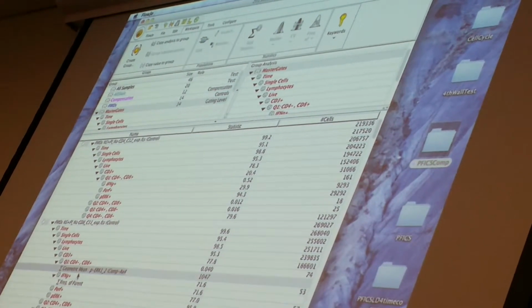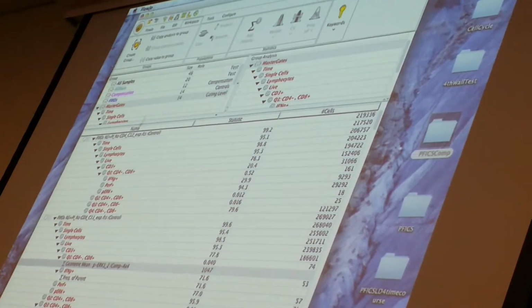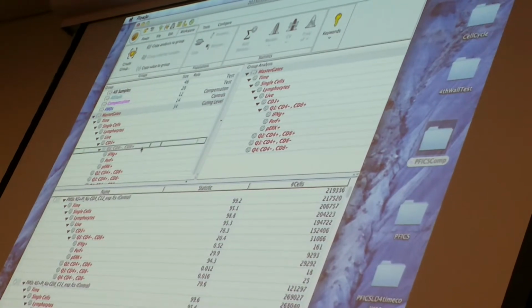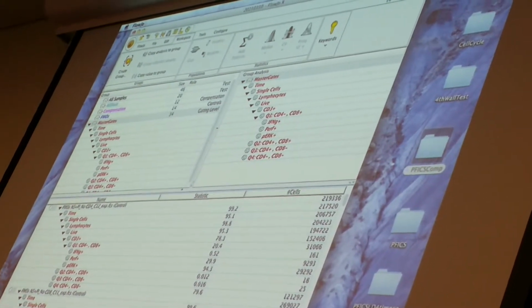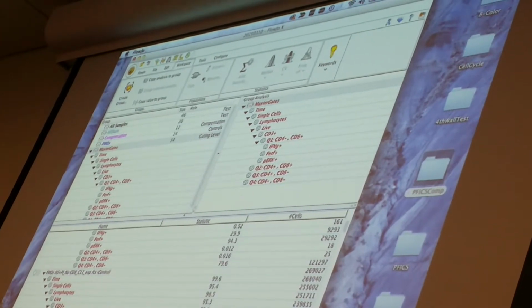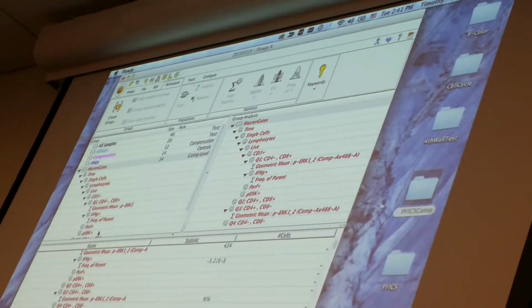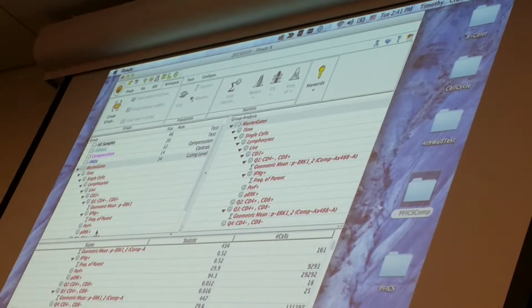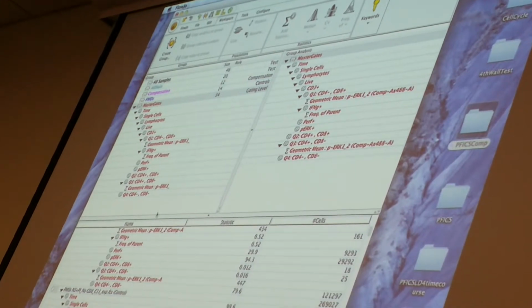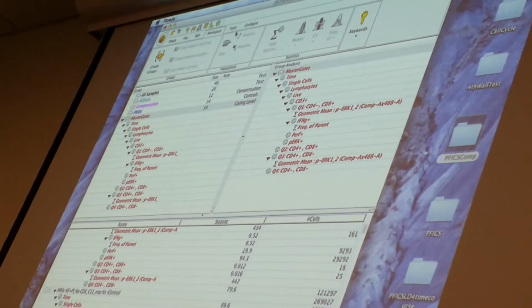Now I have three different grayed out statistics that have not been applied to my gating tree, and normally I would have to drag and drop each one of these onto the appropriate node, but I can now hold Command, highlight all three grayed out nodes, hit Copy Analysis to Group, and now it's applied all of those statistics to the group. I found that to be a nice shortcut rather than dragging and dropping all the time. So I got some statistics there.